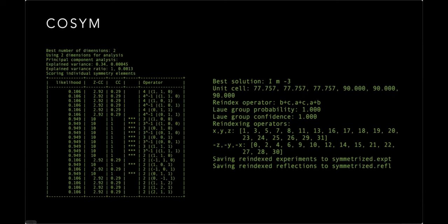But the alignment in reciprocal space resolves this. So what we can do is re-index half of the data sets by the twinning operator that takes you from one possible indexing solution to the other one, and resolve all that, and then put the data out in such a way as you can feed it straight into the scaling.